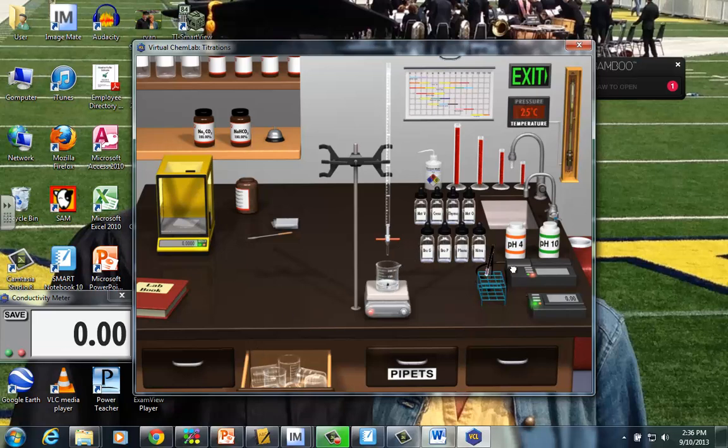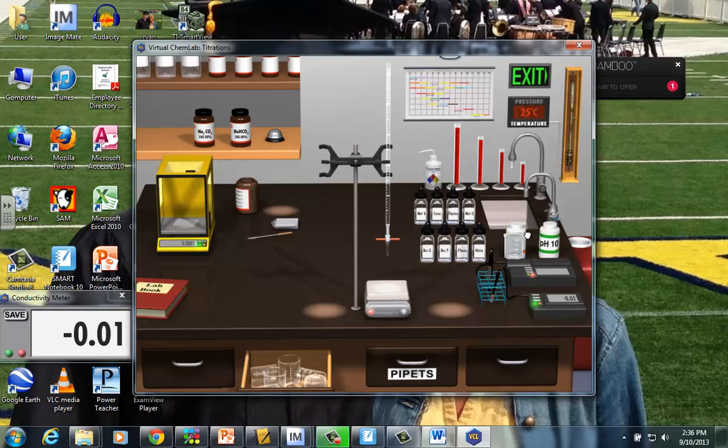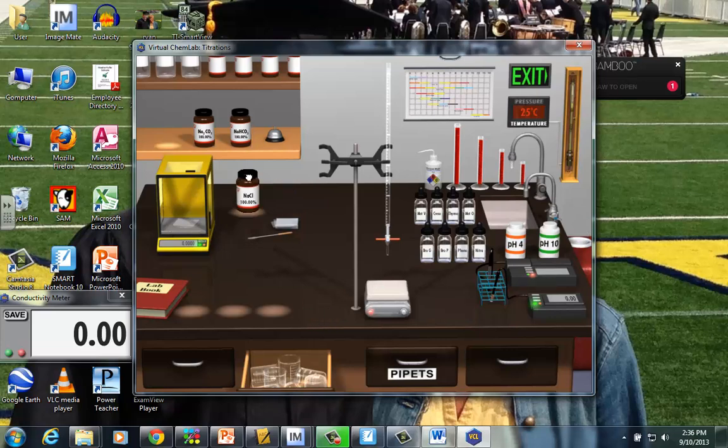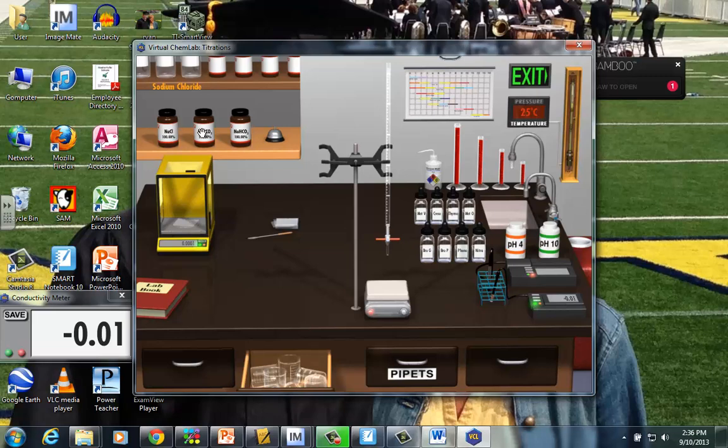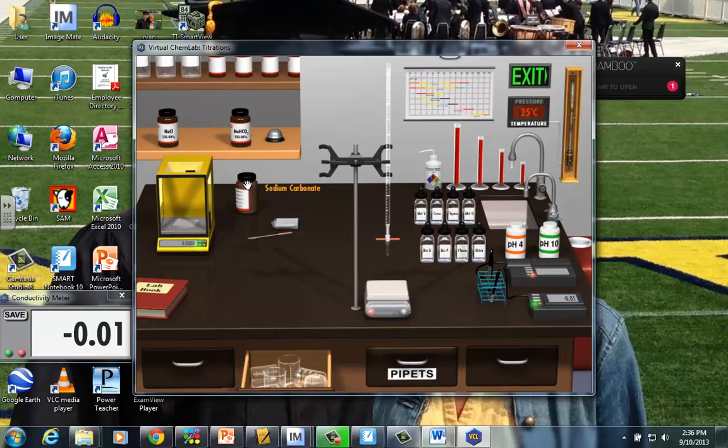Now the easiest thing here is just drag that conductivity meter back. And I'm going to place the beaker just right into this red container. That's how we're going to wash dishes in the virtual world. We'll put back the sodium chloride and the lid will go on. And let's test the second compound, sodium carbonate.